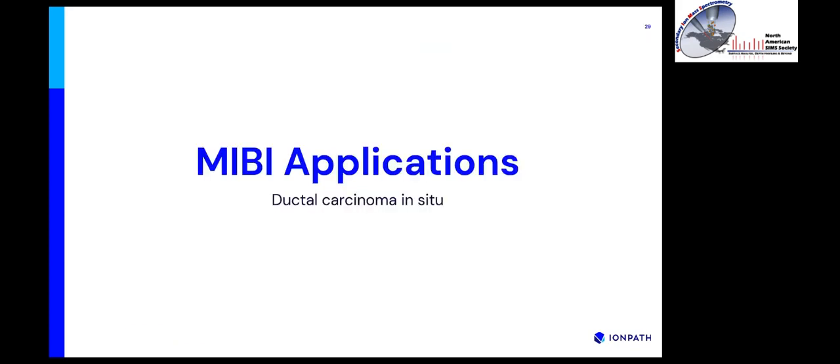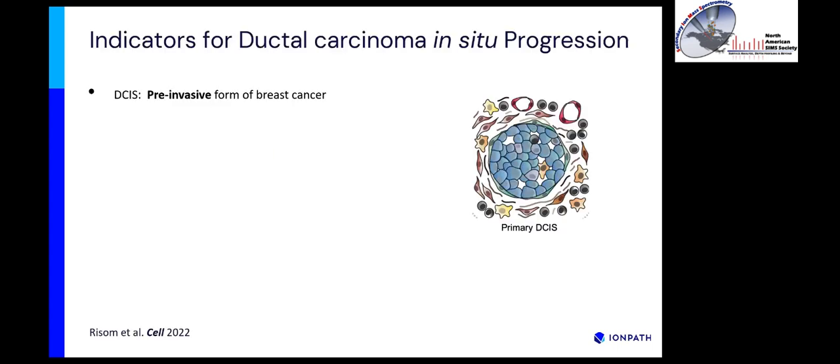So the next application I want to go over here is on ductal carcinoma in situ, called DCIS. This is another paper that was published a few years ago out of Stanford. Tyler Risom was the primary investigator on that. He's now at Genentech.